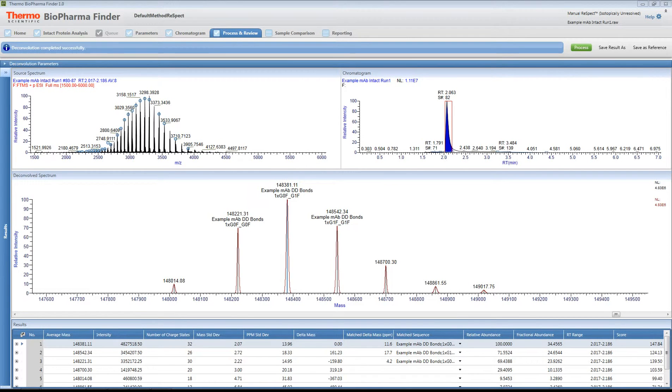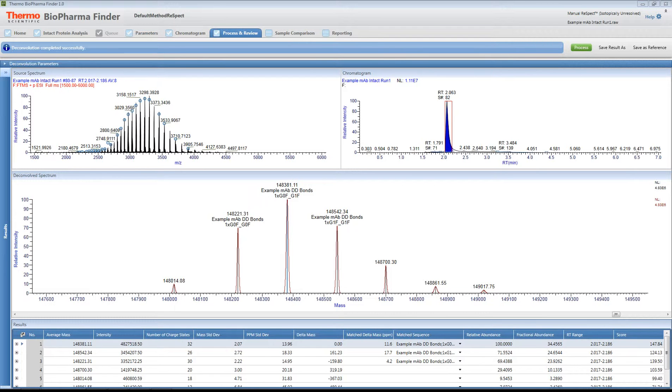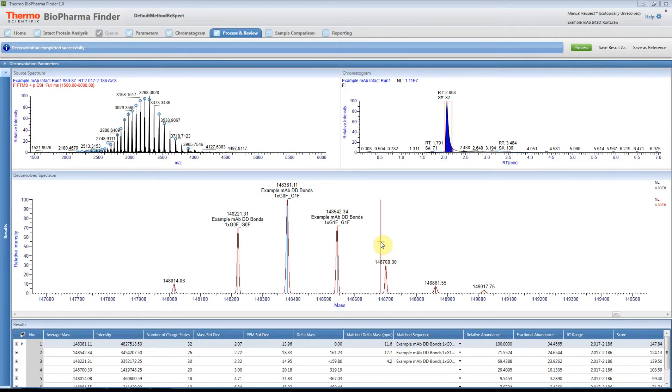Hello. In this example, I'm going to show you how to copy an image from the Biopharma Finder software in the Intact workflow, and then show you how you can edit that in PowerPoint to change the axis labels for documentation, presentations, or publications.